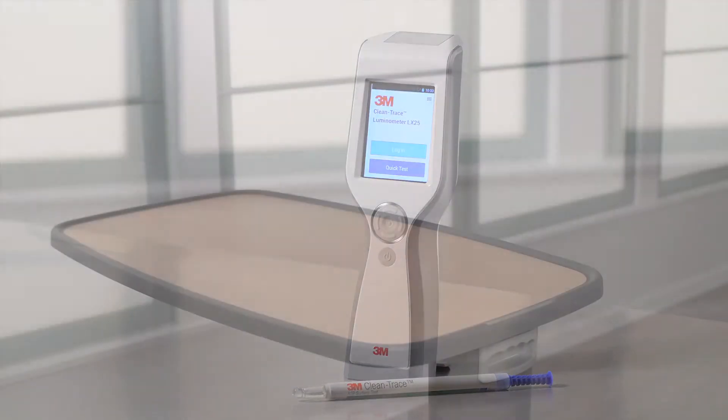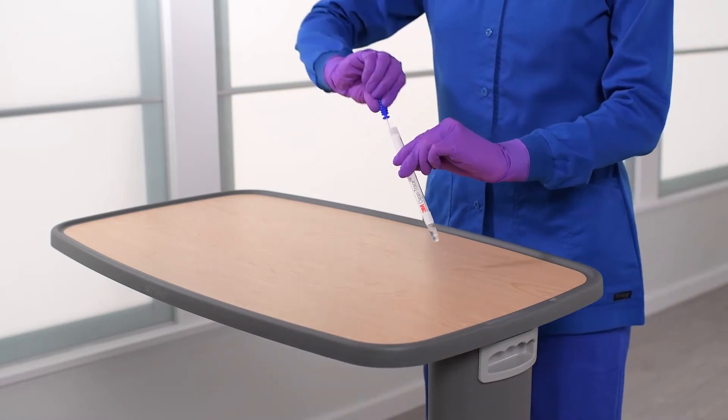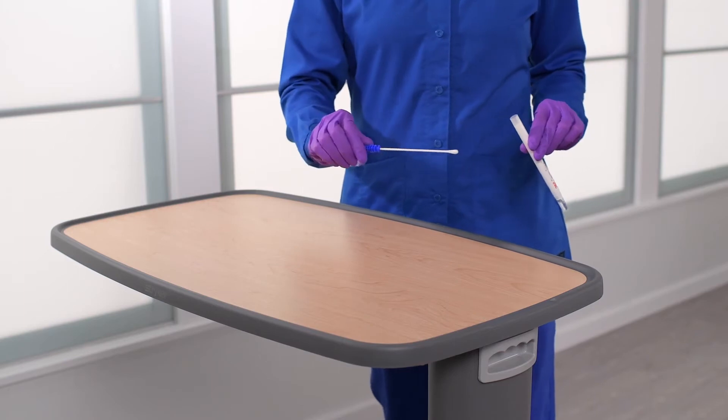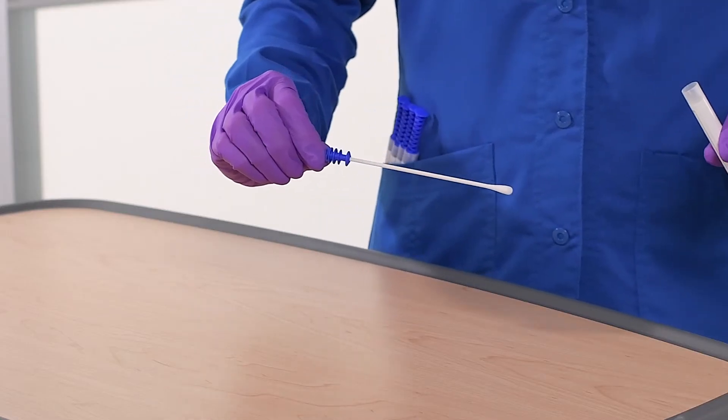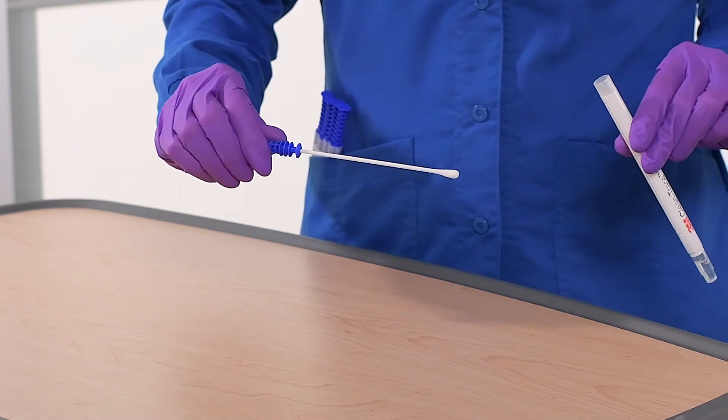Before you begin, make sure your surface is dry. When you are ready to collect your sample, remove the Surface Test UXC from the device sleeve taking care to touch only the blue handle. Do not let the swab touch any surface except that which is to be sampled.